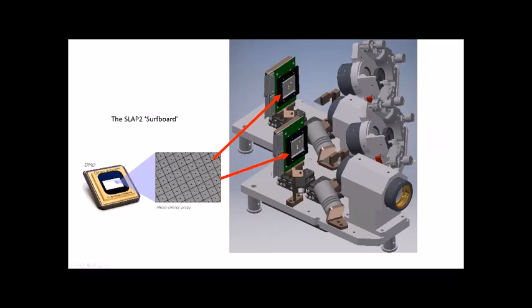The heart of this microscope is a module that takes laser light coming in, bounces it off part of a DMD, and then re-images. So it passes through a one-to-one imaging relay with a mirror. It re-images the bottom of the DMD onto the top of the DMD, where the mirrors are imaged exactly onto each other.